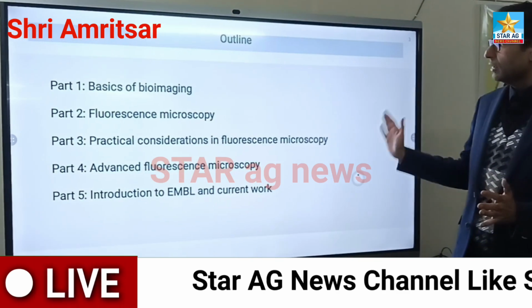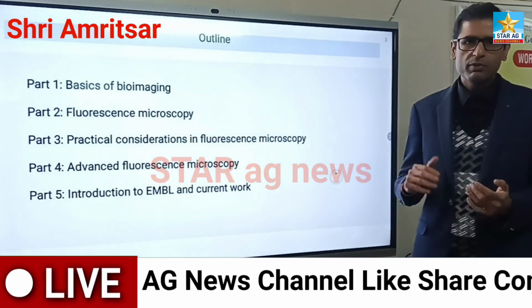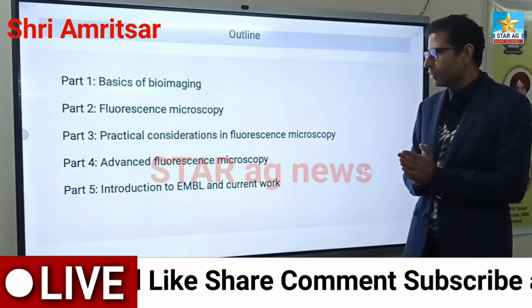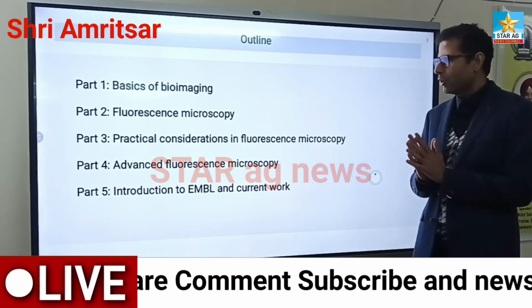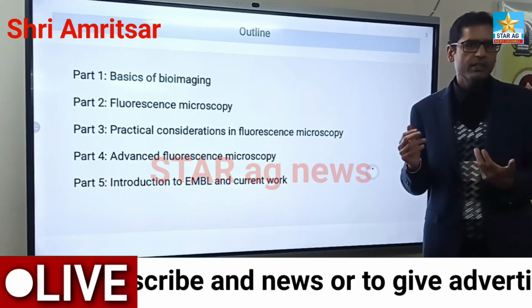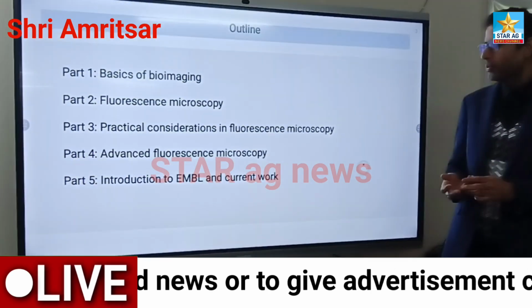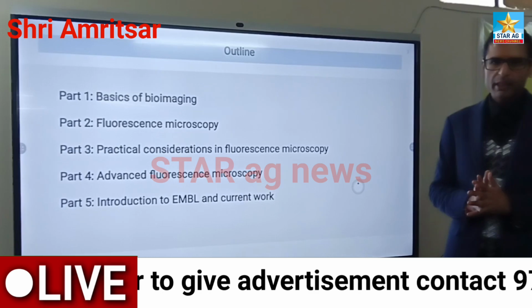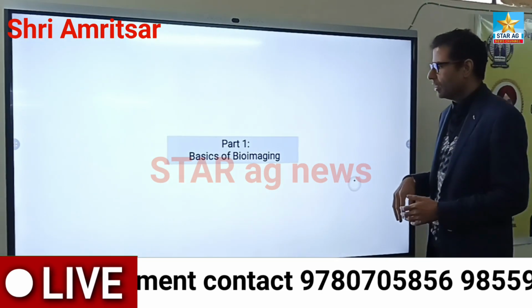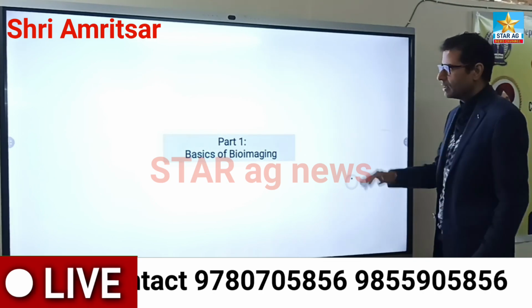So this is the outline of my presentation. First of all, I will discuss the basics of bioimaging, then I will introduce fluorescence microscopy. I will show you some practical considerations in fluorescence microscopy. Then I will discuss advanced fluorescence microscopy techniques, and finally give you an introduction to EMBL and my current work. So this is the first part.